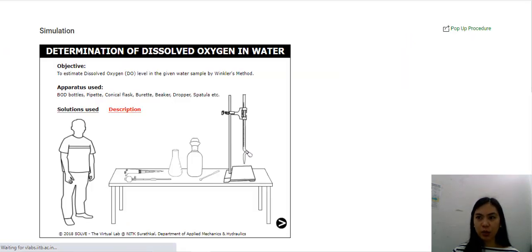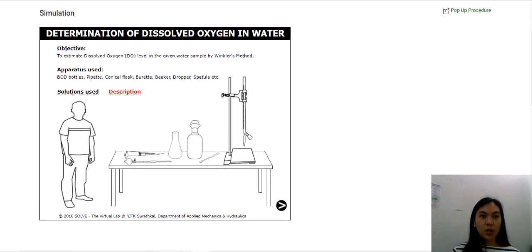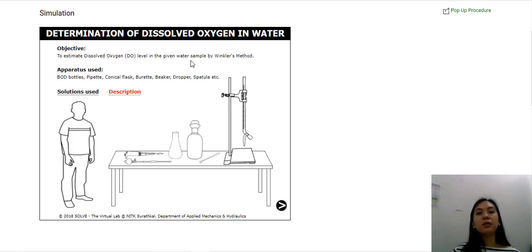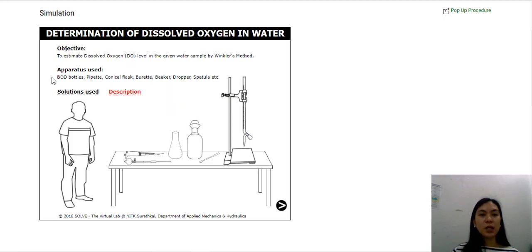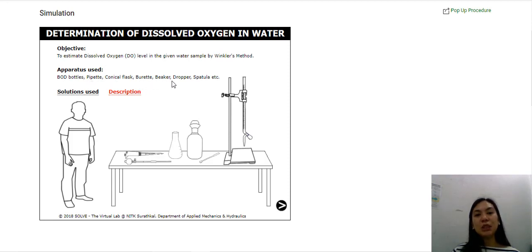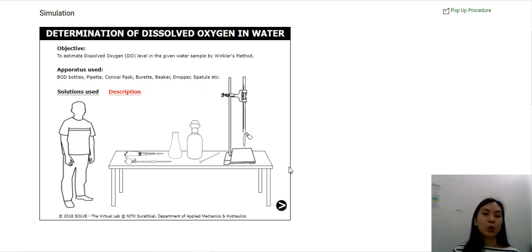Clicking on that will prompt you to this particular page — Determination of Dissolved Oxygen in Water. The objective is to estimate DO level in the given water sample by Winkler's method. DO is just a short term for dissolved oxygen. These are the apparatus that we will be using: BOD bottles, pipette, conical flask, burette, beaker dropper, spatula, and other miscellaneous apparatus. Click on this button to proceed to the next phase.